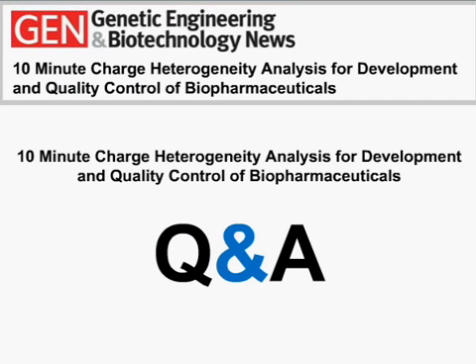Okay. And Scott, do you have any recommendations for an ampholyte composition of a monoclonal antibody with a PI of approximately 9.6? Yes, you can typically use a 4% 3 to 10 gradient and then use a 5 millimolar arginine cathodic spacer to initially screen for the compound.